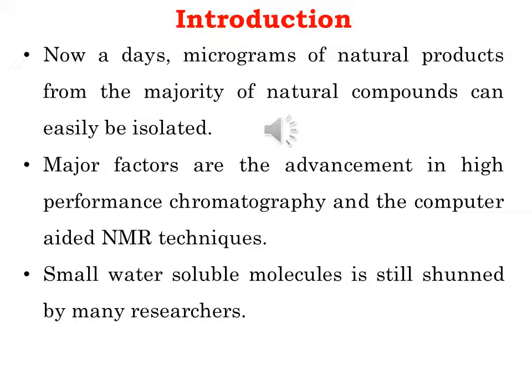Recent advancements in separation and structure elucidation methods have been remarkable. It is not unusual for some micrograms of substances to be purified from vast amounts of biological materials and their structures elucidated.